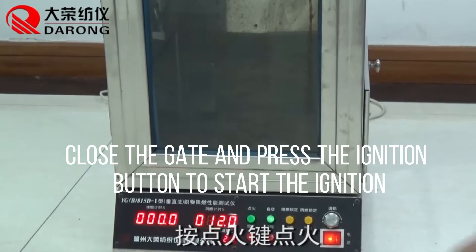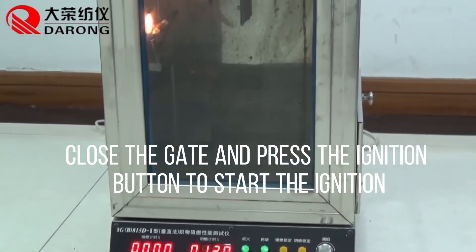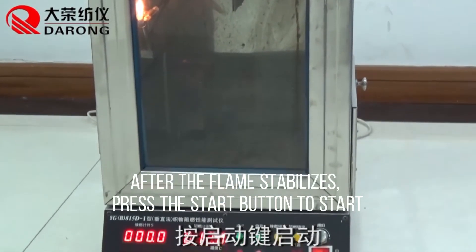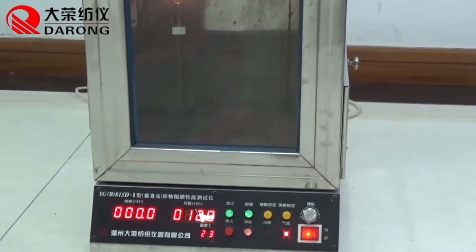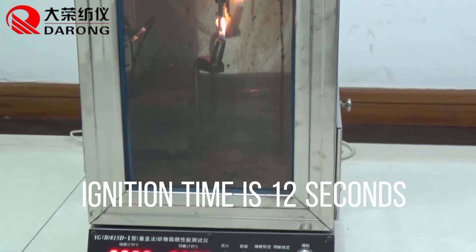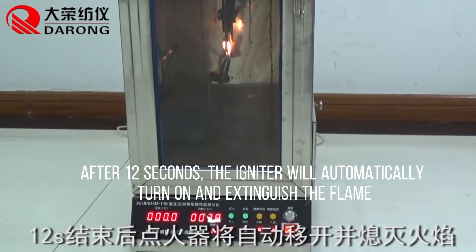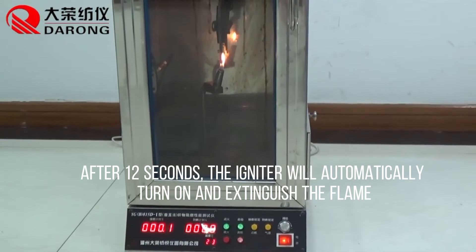Close the gate and press the ignition button to start the ignition. After the flame stabilizes, press the start button to begin. Ignition time is 12 seconds. After 12 seconds, the igniter will automatically turn on and extinguish the flame.